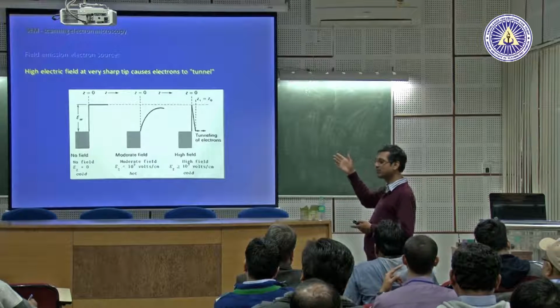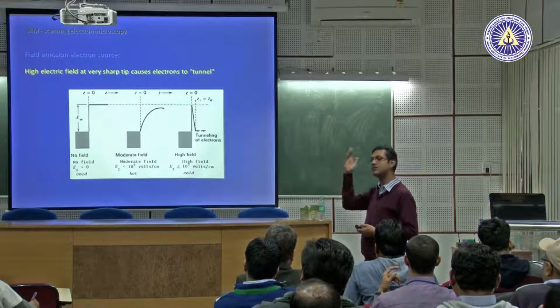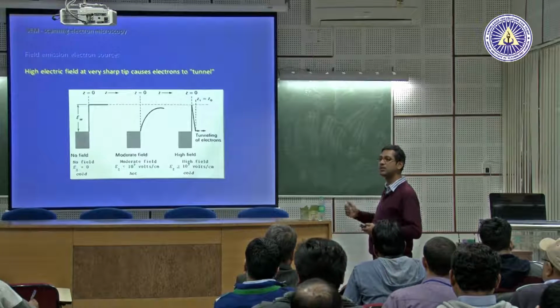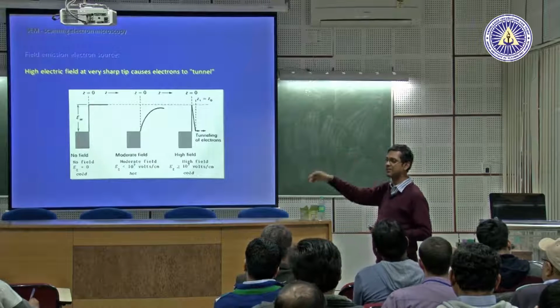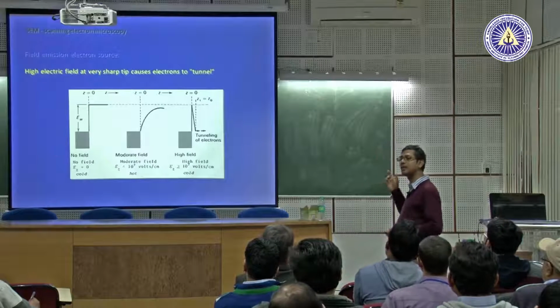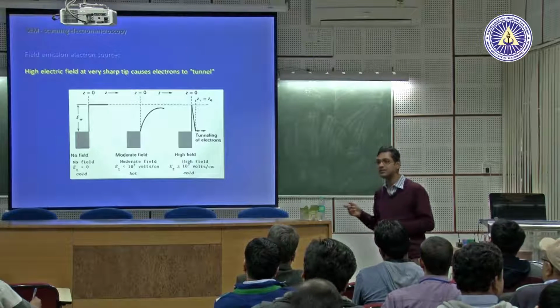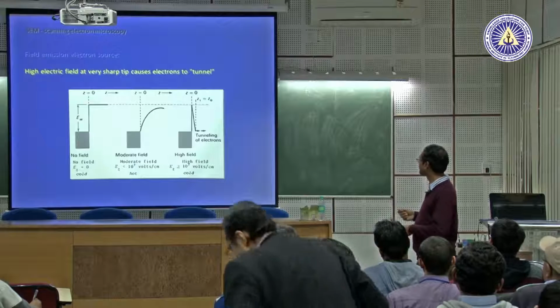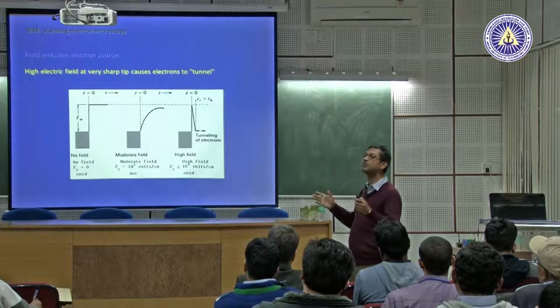Chromatic aberration from light is the same as this, because light has different wavelengths from red to green, so you have aberrations in the lens. The same thing happens in the tungsten filament, but here, because electrons are tunneling through a barrier and you are applying a huge field, the energy width of the electrons coming out will be very small.